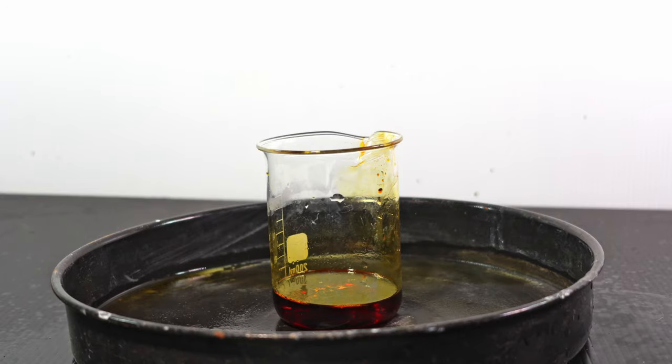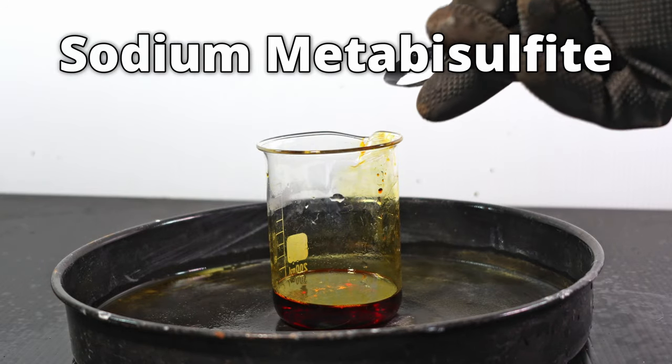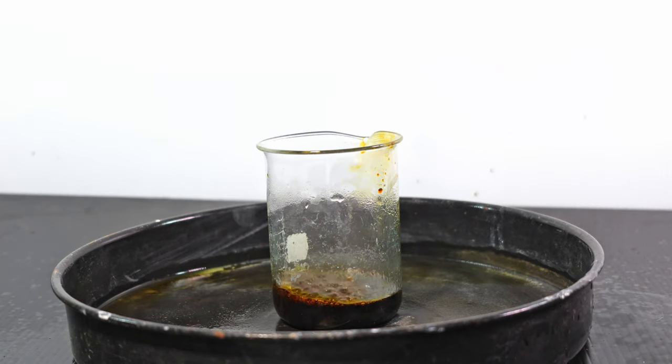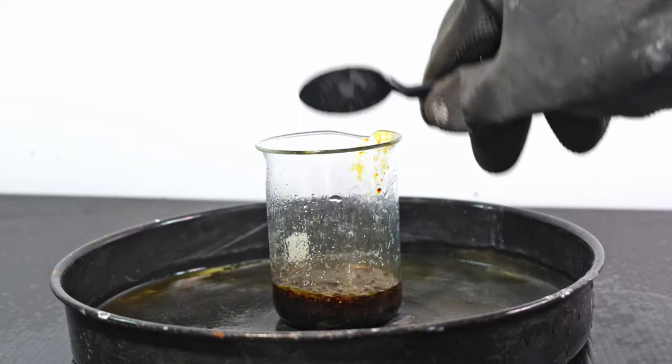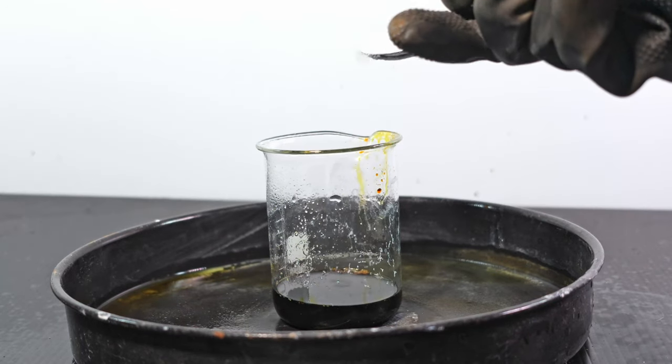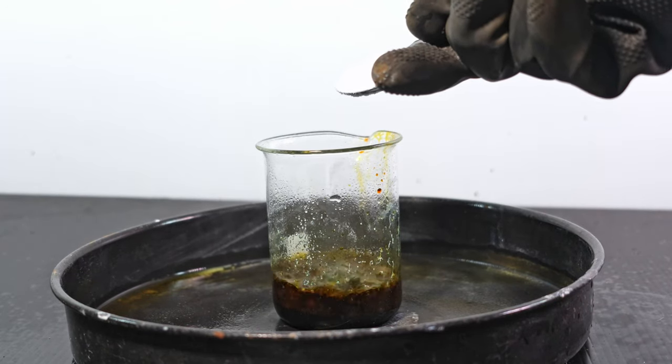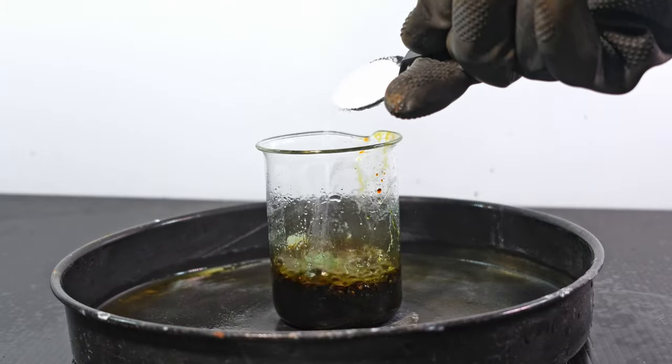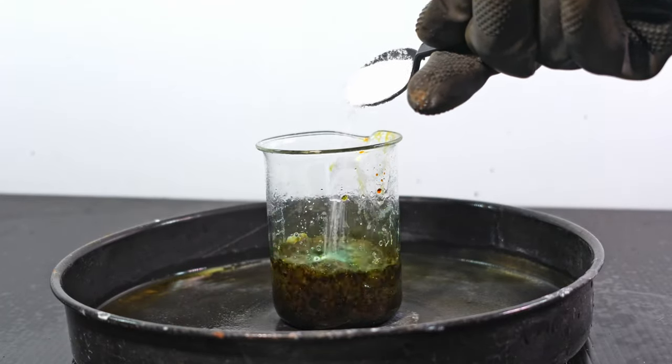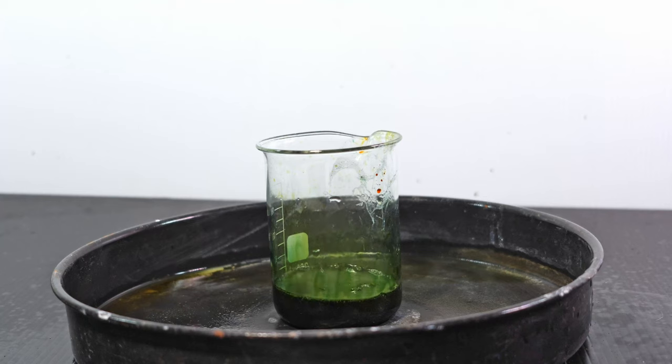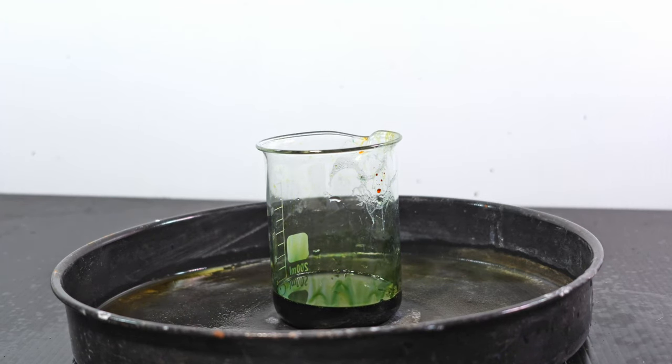In the sixth test, I react sodium metabisulfite with chromic acid. As I add more, flashes of green appear in the solution. Eventually, it all turns green. That is because sodium metabisulfite is an alkaline reducing agent. Not only does it neutralize the acid, but it also reduces chromium-6 to chromium-3.